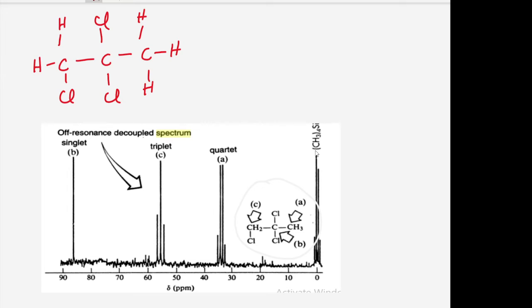So this is a compound. We are going to determine the NMR spectrum of this compound. First of all, let's look at this carbon. This carbon is attached to 2 protons. In the carbon-13 NMR spectrum, you should know that we will not count the splitting from the neighboring carbon's protons. So if there is a proton in the place of the chlorine, we will not count that in the splitting of that carbon. We will only include the splitting from the protons that are attached to that carbon.